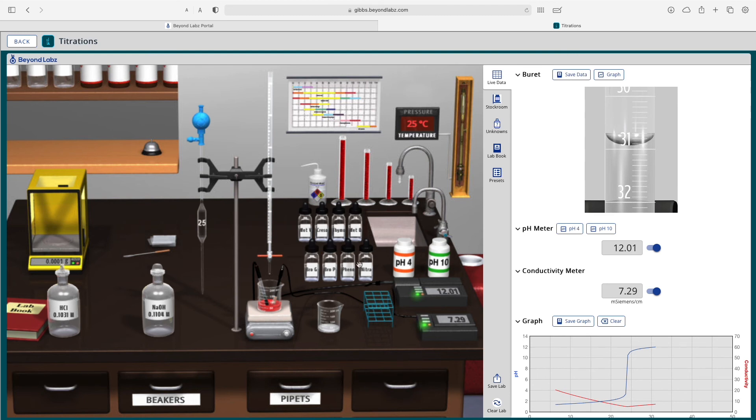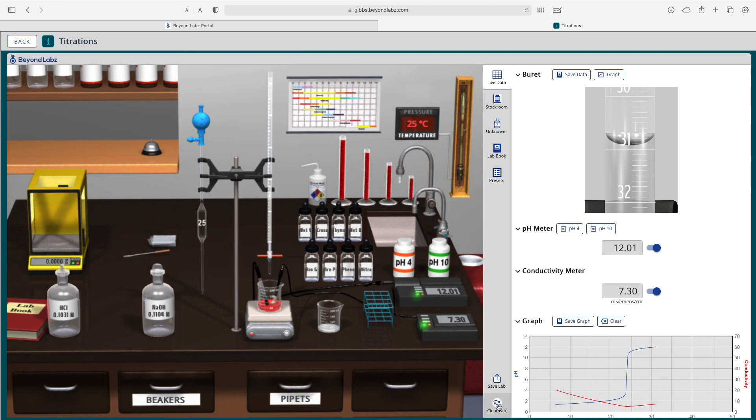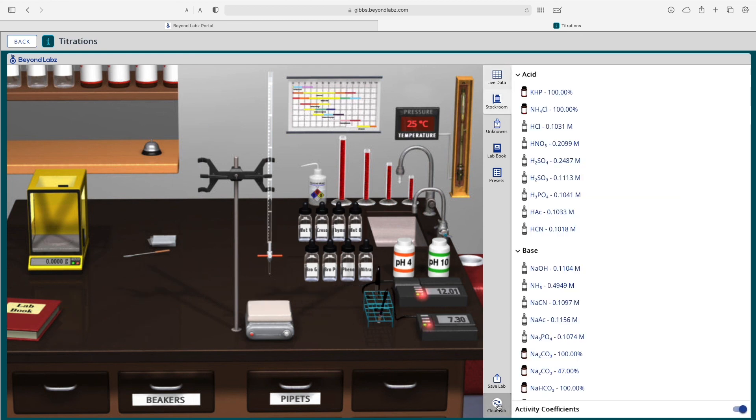The last thing that may be helpful to show you is if you want to clean up your mess but do it quickly rather than refreshing your browser, just click on the cleanup lab bench bucket here or the clear lab button here and it will clean up the lab for you and you will be good to start a new experiment.